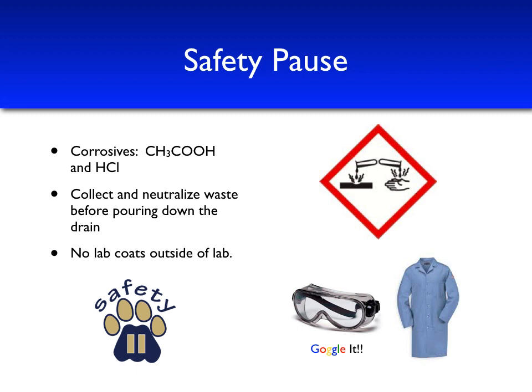Today's safety pause reminds us that we'll be working with mildly corrosive acids and bases at the concentrations used in this experiment. We want to make sure that we wash our hands before leaving lab and wear gloves when necessary. We also want to remind you that acids need to be collected and neutralized before being flushed down the drain with plenty of water as disposal.